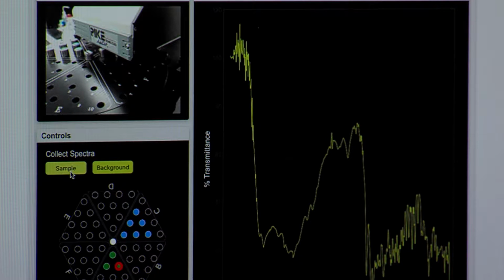Now, this might be of interest for situations where somebody has perhaps adulterated a drug. So if you were looking to see if a drug was pure and it wasn't a counterfeit, you might use a machine like this to analyse it. Okay. It's amazing that it's actually physically so close to us and you can see it all happening. Exactly. Yeah, it's quite nice.